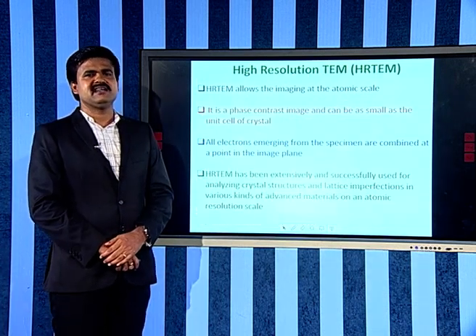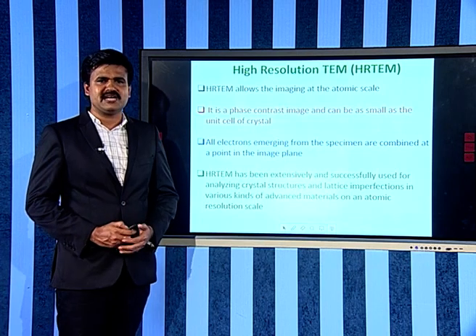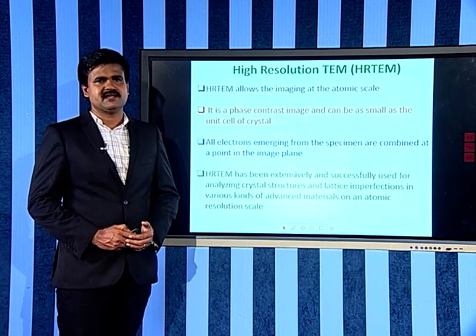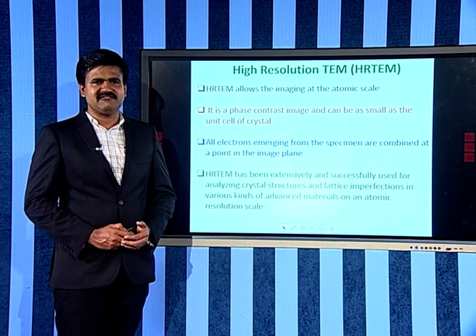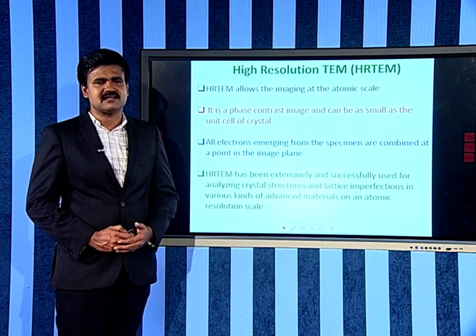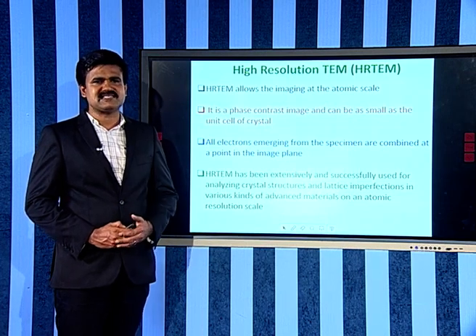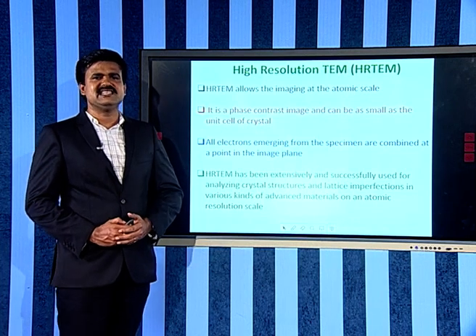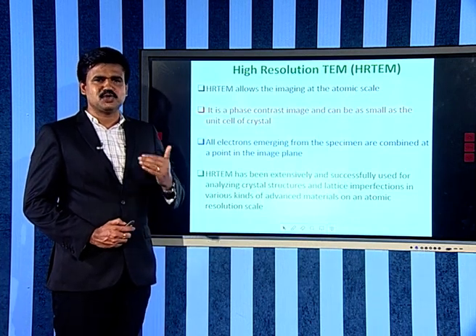Now, high resolution transmission electron microscopy, notated as HRTEM. This is a recent development in transmission electron microscopic procedure to improve its performance and analytical value. HRTEM allows imaging at the atomic scale.